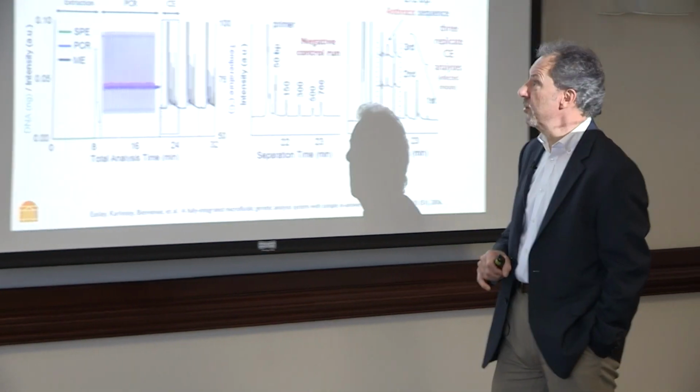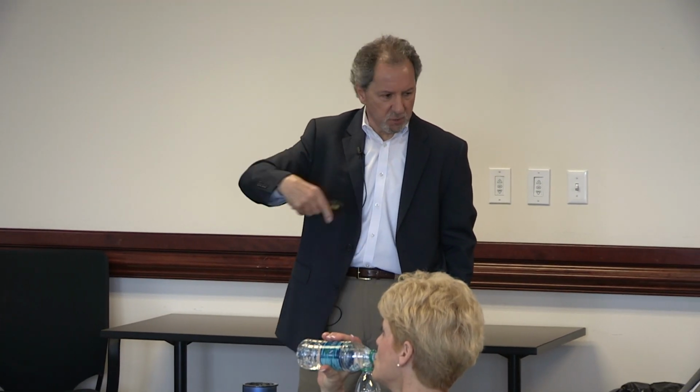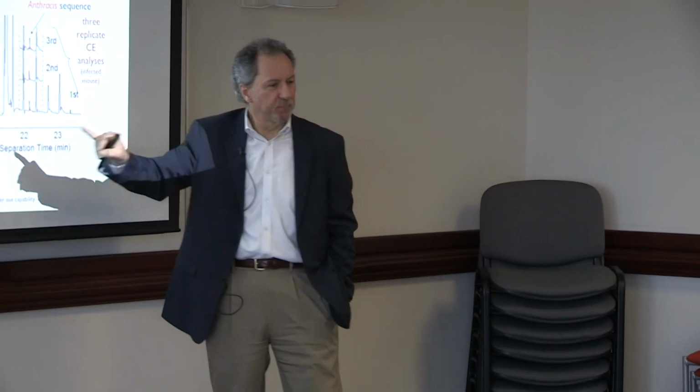And one of the things that we did way back in the day, and you'll see that this involves the good Dr. Bienvenu here, who used this as a means to make an argument for actually getting out of her graduate program. We showed that you could do this kind of integrated sample in, answer out analysis in less than a half hour. Now, if you talk to Joan, she'll tell you it's not nearly as pretty as it presents here. What's that? But the bottom line is it was one of the first examples to say that you could actually put a whole sample, and that sample was about 700 nanoliters of mouse blood, into the device and actually get a readout that said something was there. And so that was pretty powerful.